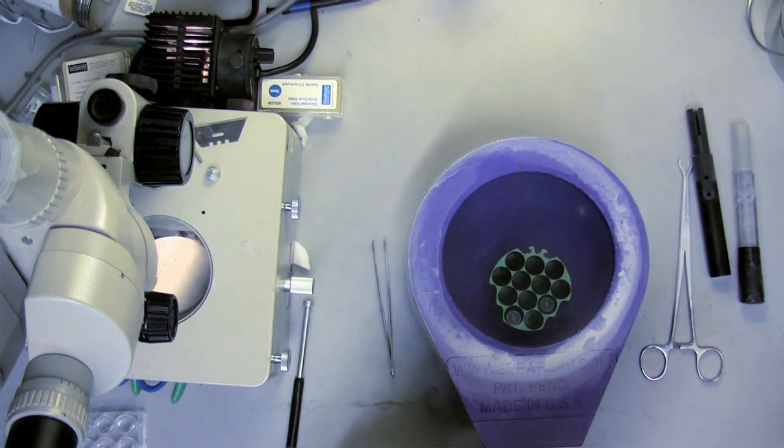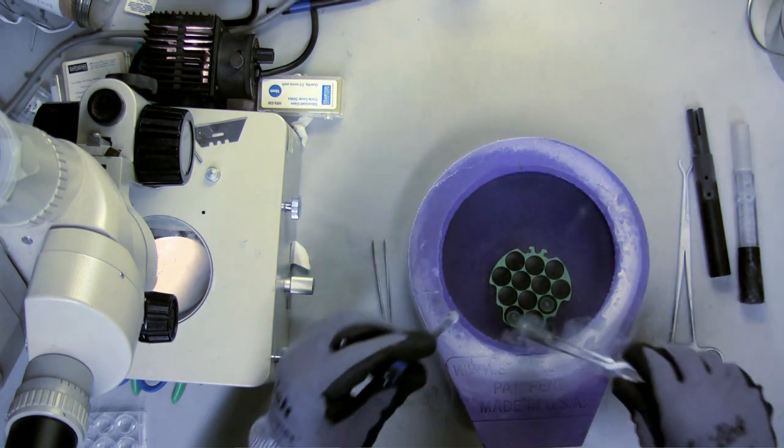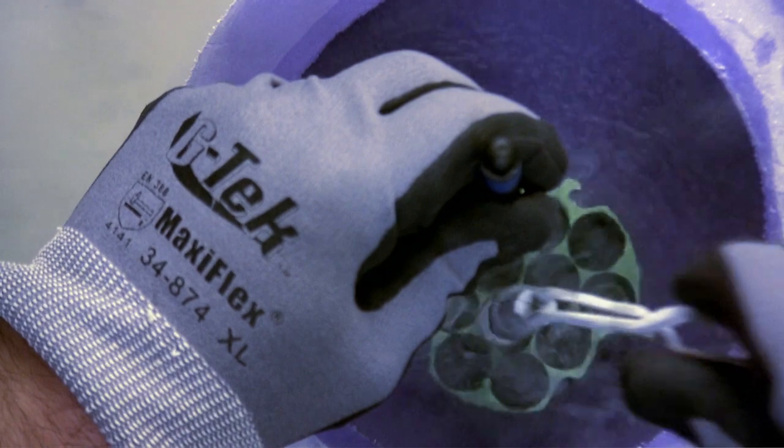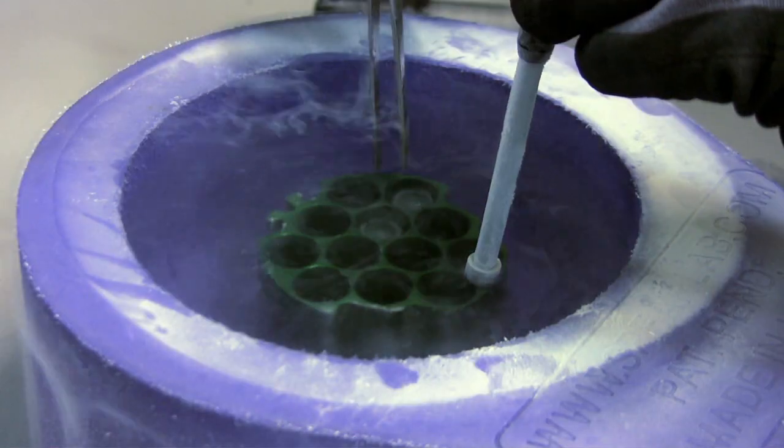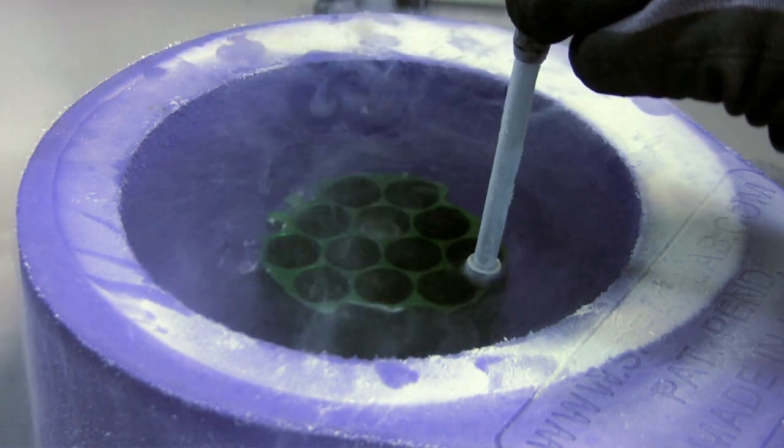Cryo vials can either be left on or removed for shipping. To remove a vial, you can either pull it off with cryo tongs or play a game of operation and take it out with forceps. I like to hold the puck down with a crystal wand while I do this.